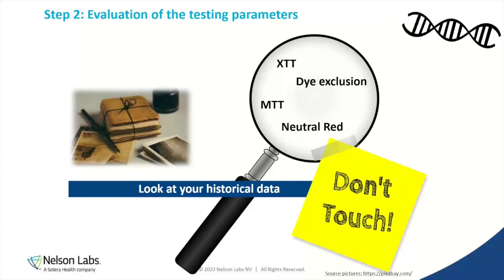I think, Audrey, I'm not sure how much we can emphasize this, but I think you can add this as well. Right, we don't want to just test to compliance. If we see a failure, let's understand it and move on from there. A fail here doesn't mean you're permanently punished forever. We can find other options. But the option is not to just ignore it and switch to a test that gives you a pass. No. That would be considered testing into compliance. You're getting out of the room, but it's not the right door. You have to leave out front. So it's not okay. Really important take-home message.